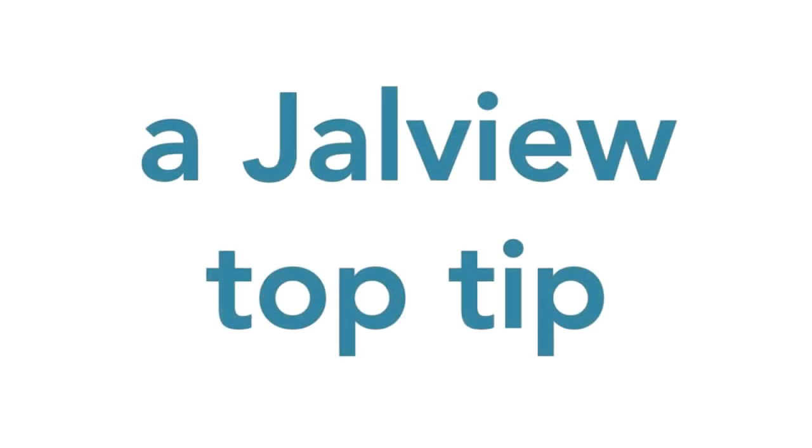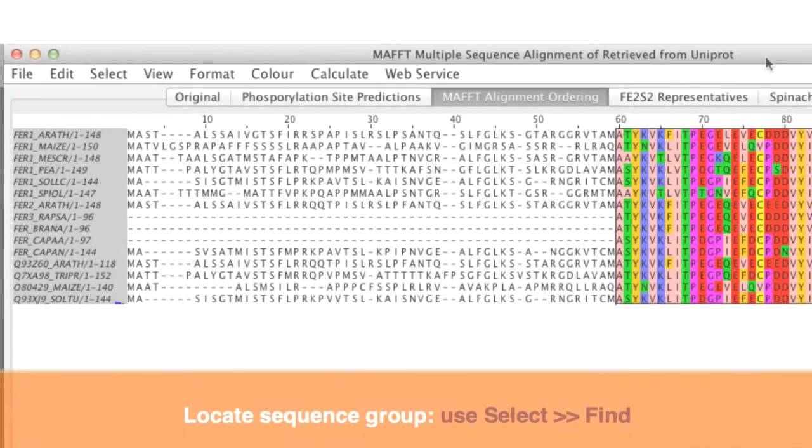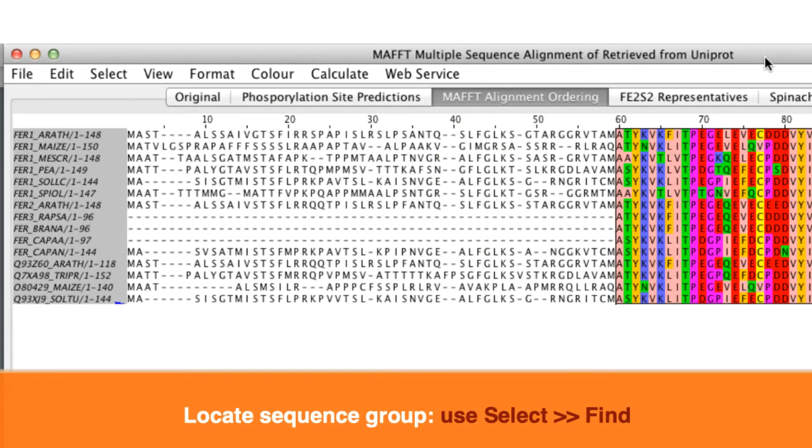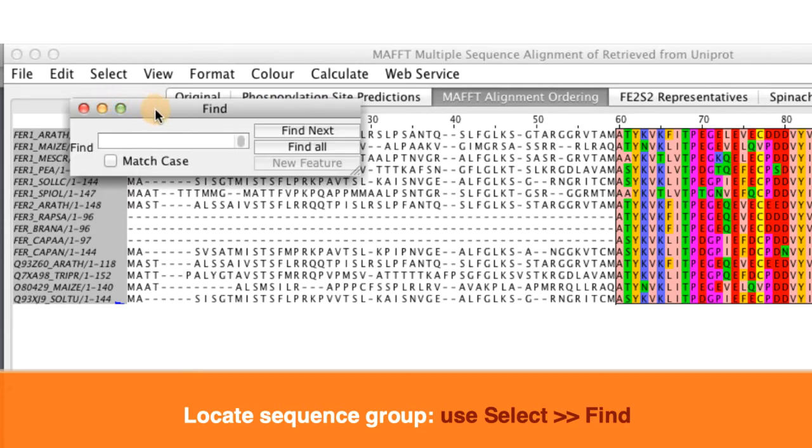To close here is a Jalview top tip. You can quickly locate a group of residue alignments in your sequence by using the find option. So go to the select window and in the drop down menu select find.